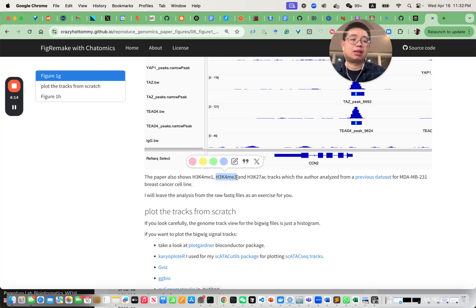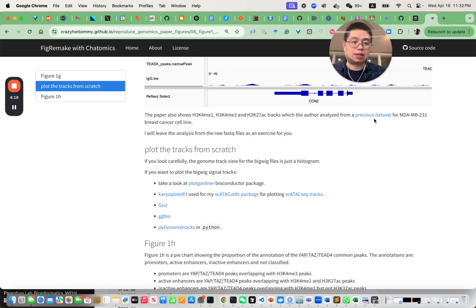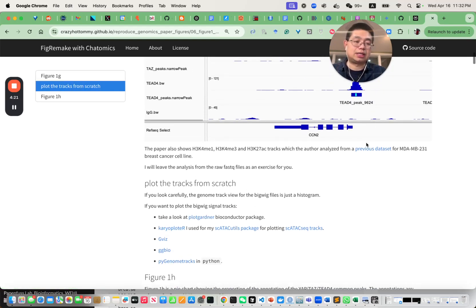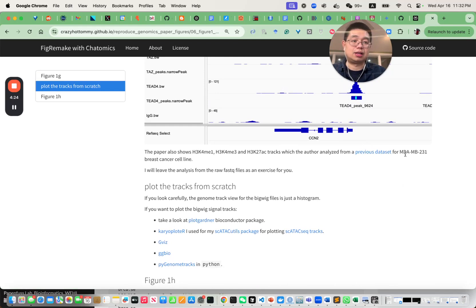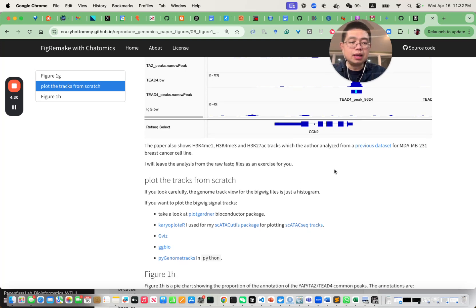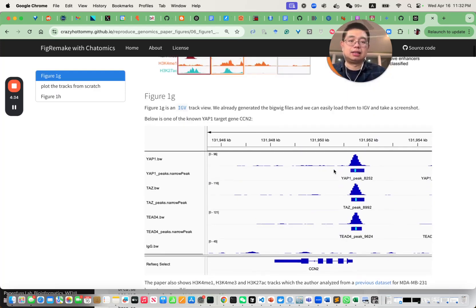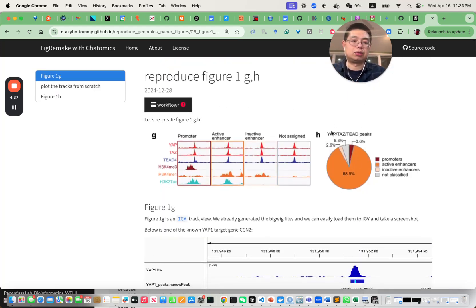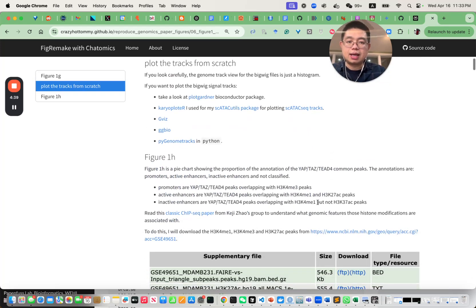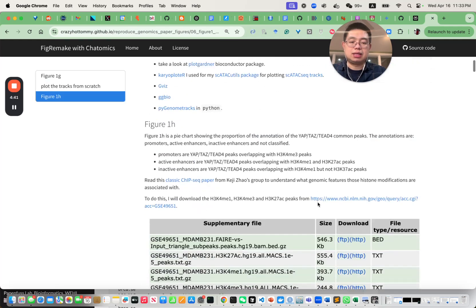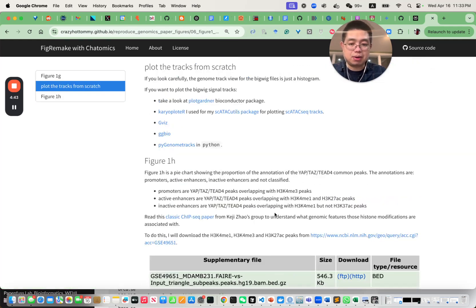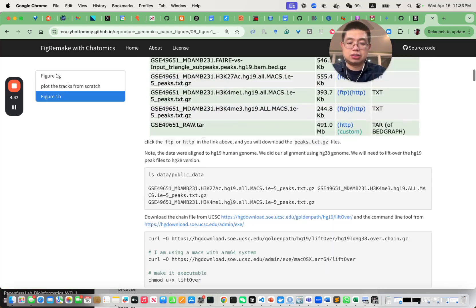This is actually a previous dataset that the authors downloaded from the same cell line — MDA-MB-231 breast cancer cell line. They downloaded the previous data and used it to annotate the overlapping peaks among those three transcription factors. You can read the paper — I believe it's from Keji Zhao's group.